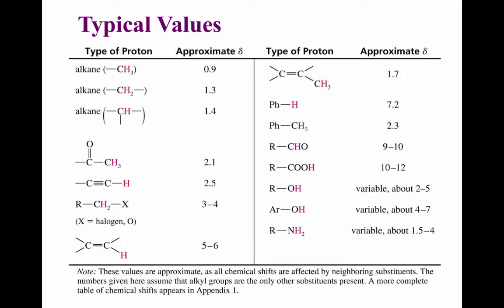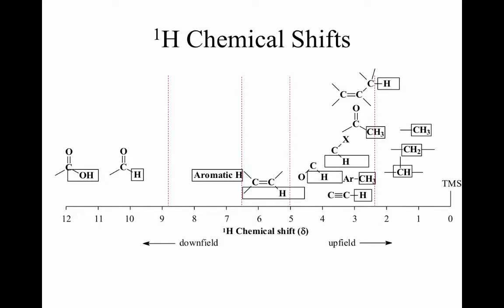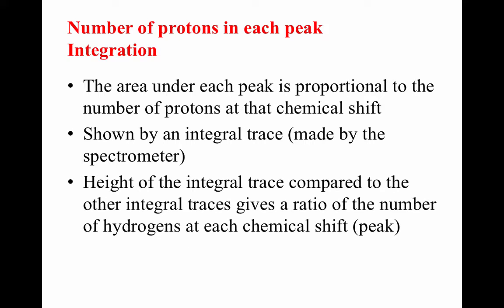So how can we tell where they're going to be? Well, their chemical shift, there's the table in your data booklet, table 26, 27, or 28. It shows you approximately what that chemical shift will be, where those peaks are going to be found. And that's going to help us identify what functional groups are present in our molecule. Okay. And we'll get practice in class doing that.